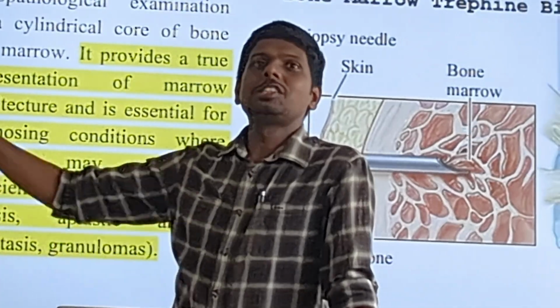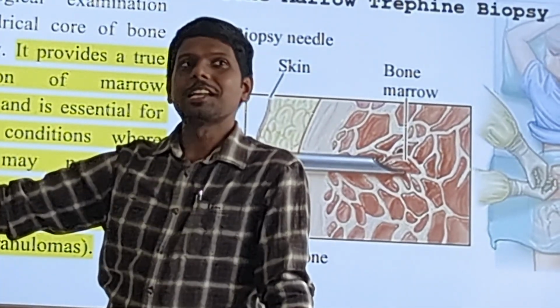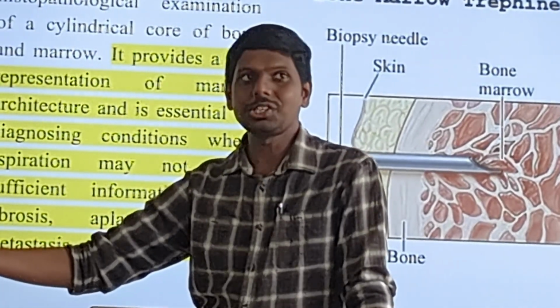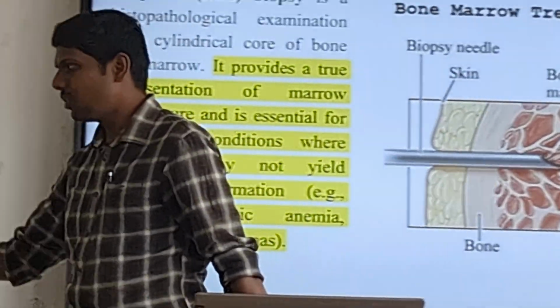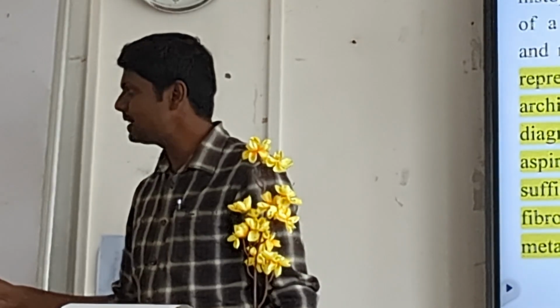See, suddenly you are seeing some trend in this flow. What is that? Suddenly it is shifting towards histopathology. Do we have a histopathology subject? Tissue processing. Yes. So we are going to do all tissue processing steps for biopsy, because this is a biopsy sample at the end of the day, and a biopsy sample must undergo tissue processing steps.